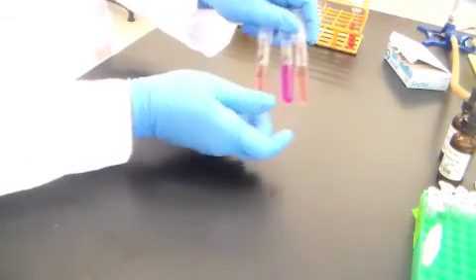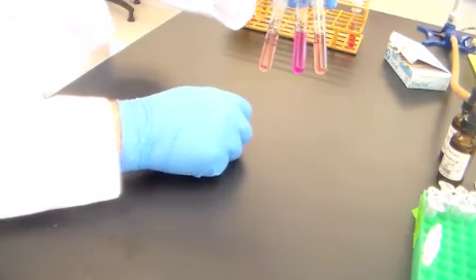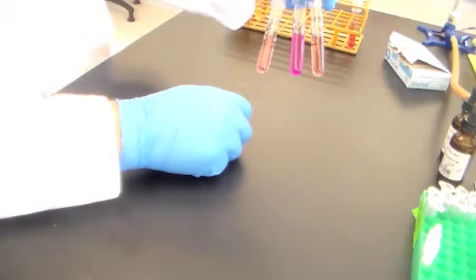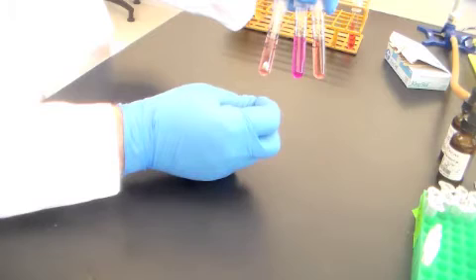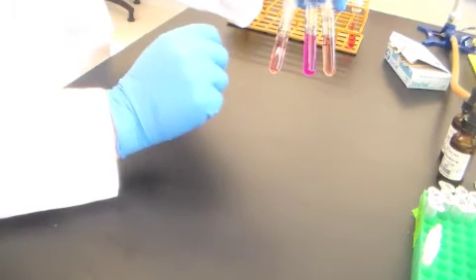This was the urease broth. So you inoculated 3 different urease broths, and this is what they look like uninoculated. I didn't pull a truly uninoculated one from the refrigerator, and I should have. But what you see here is 2 negatives on the outside flanking a positive urease organism in the middle. This media has a very rich source of urea within it, that 1 carbon molecule with 2 amine groups associated with it. The media looks like this to begin with. The pH is around 6.8, and the pH indicator is this color.